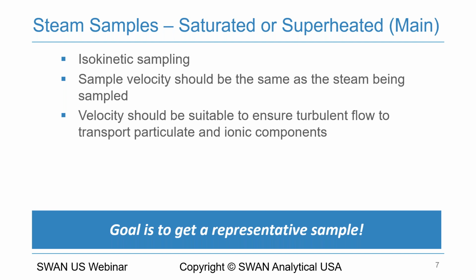Short answer is yes. There may be situations where, because of the limited flow that's available, I may not have the excess pressure that I need to do a back pressure regulation. But for 99% of the applications, a back pressure regulation device would be my first recommendation.